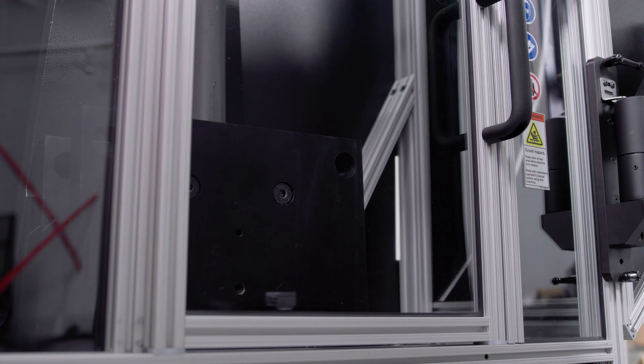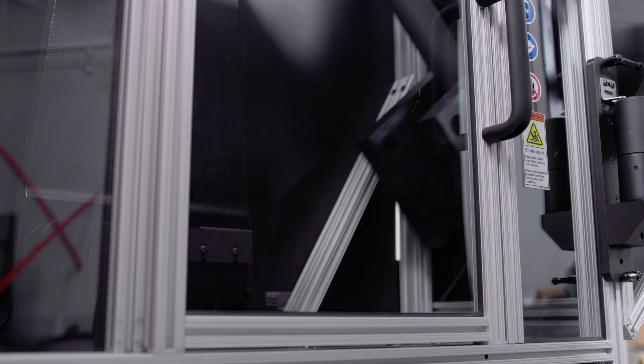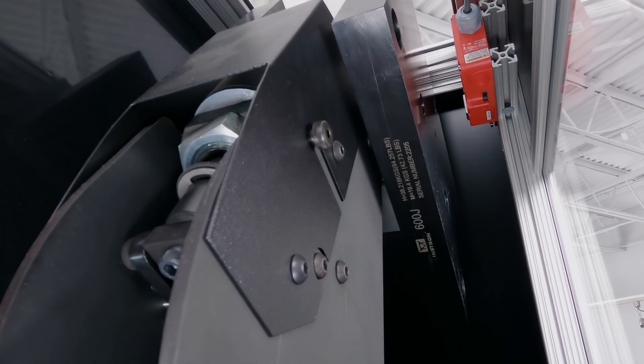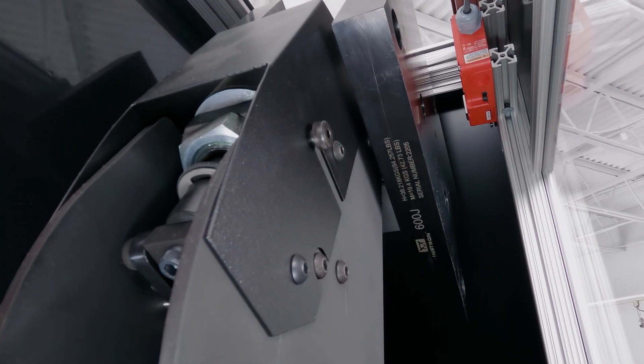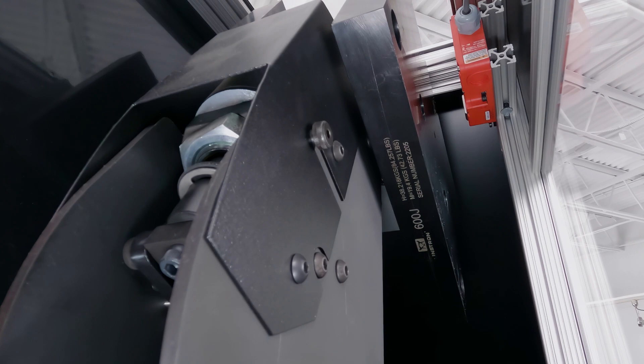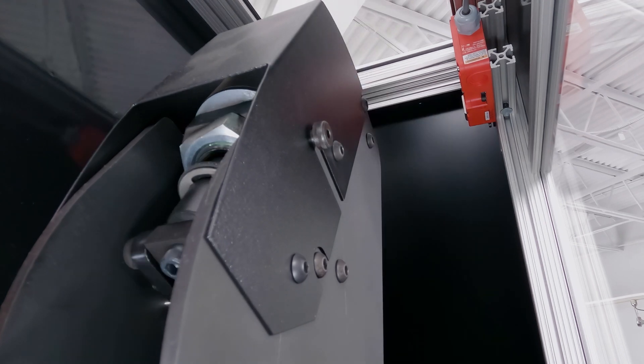These systems feature a motorized hammer with an automatic return, eliminating the need for the operator to manually catch and relatch the hammer during each test.